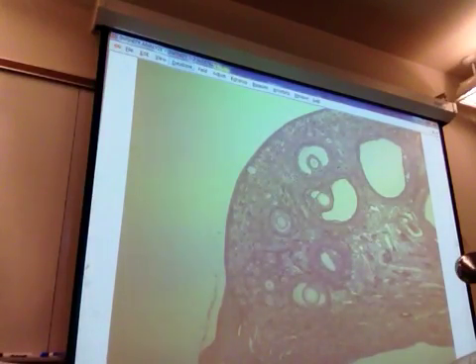So out here, what are these? Follicular cells. I thought the theca cells were on the outside of the granulosa cells, from what I read in the book, aren't they? No, wait, the granulosa cells are the innermost. Yeah, so it goes granulosa and then theca, and then follicle. So here, if you've got the corona radiata, there's granulosa cells and theca cells in here, right?